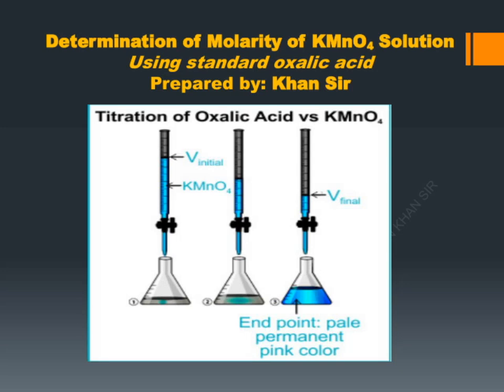Welcome everyone. Today, I'm excited to present on the topic determination of molarity of KMnO₄ solution. We'll be using standard oxalic acid for this experiment. This presentation will guide you through the process of calculating the molarity of potassium permanganate solution. We'll cover the basic concepts, the procedure, and some important calculations. Let's get started and explore this interesting titration method together.